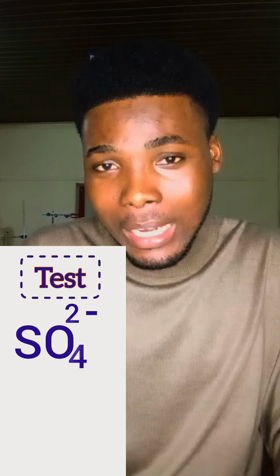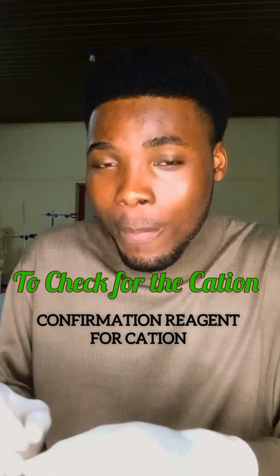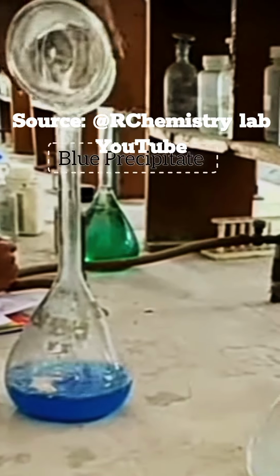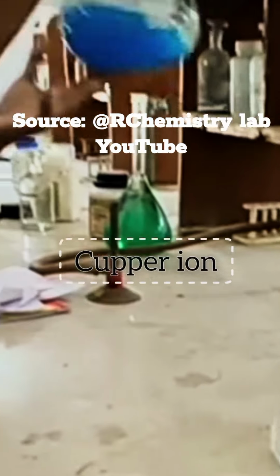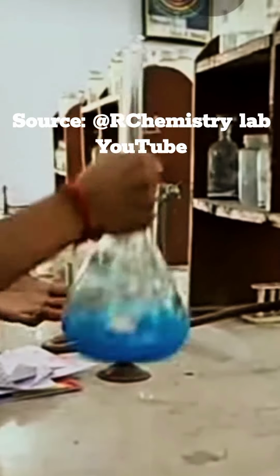So how did I know? We will carry out a test for the cation, and then a test for the anion. To check for the cation, we basically use sodium hydroxide and aqueous ammonia. I have prepared a solution of sodium hydroxide. The moment I add sodium hydroxide and I get a blue precipitate, that is a sign of copper ion. It's only copper ion that gives a blue precipitate when you add sodium hydroxide.